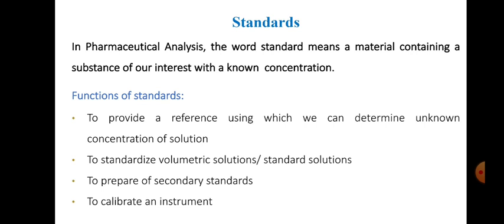When you want to perform the titrations, usually we take a solution of known concentration in the burette. So we practically perform these titrations, we prepare the standard solutions using the standards, and then we practically verify whatever concentration we have prepared, let's say 1 molar or 0.1 molar, is it really the same molarity or is it of different molarity. So we verify practically the concentration of the prepared solution using these standards, because unless and until we have a standard we cannot compare whether what we have prepared is of the same concentration or a different concentration.